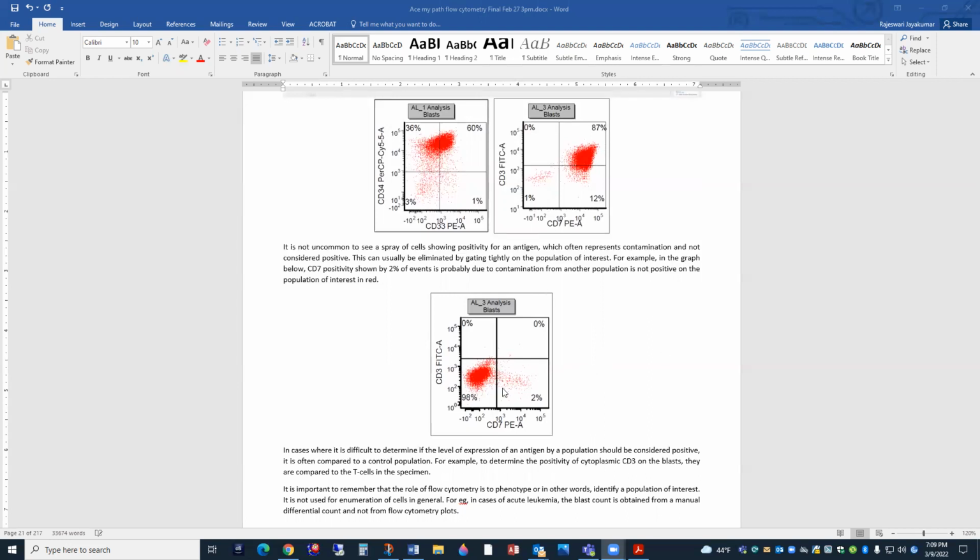But if you see it persistently in many other plots, and it is expressing something specific, you can gate it and identify what population it is. And if you think that is a separate population of aberrant cells, then it is worth working it out.